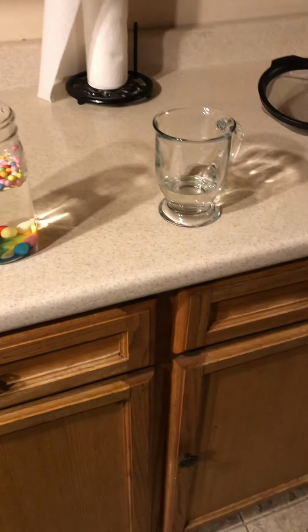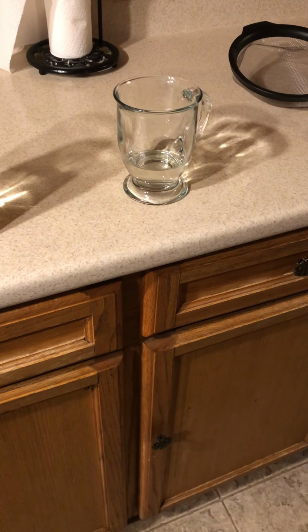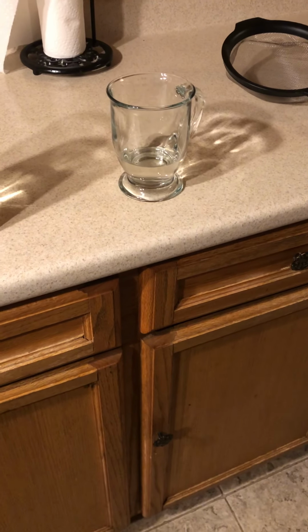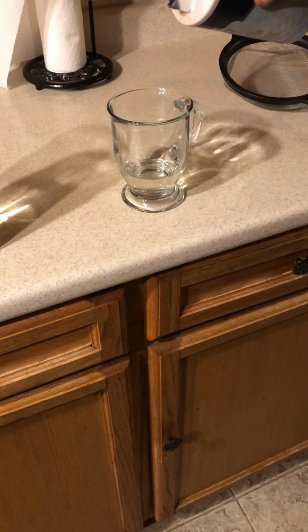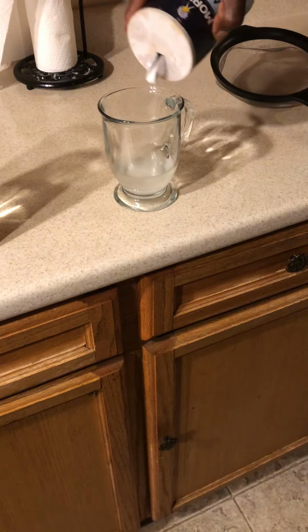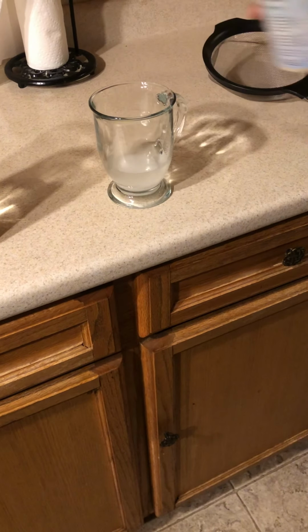The first thing we're going to look at is evaporation. So we're going to put some salt into the water. Keep pouring. Thank you so much, Mr. Barber.